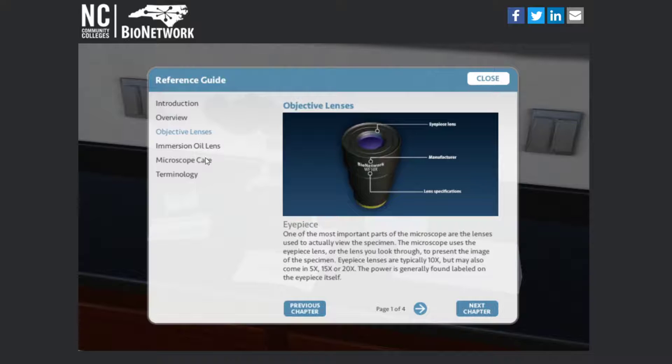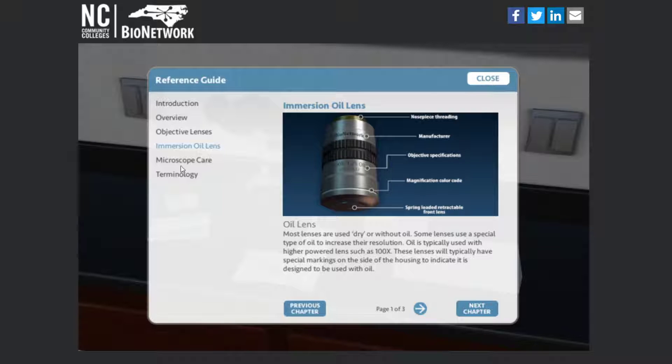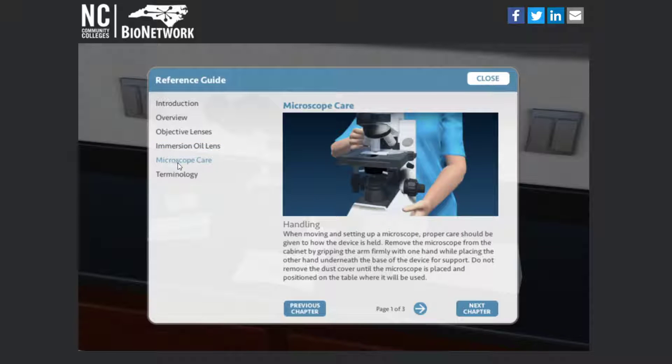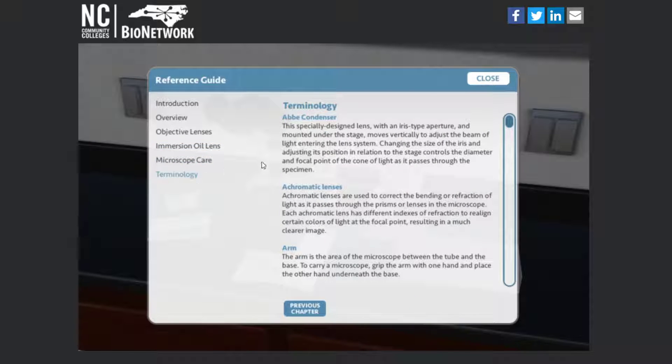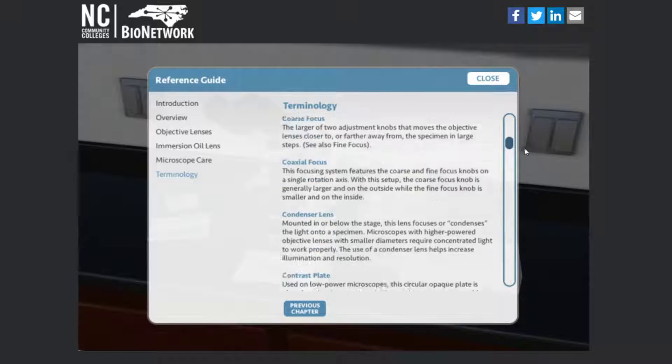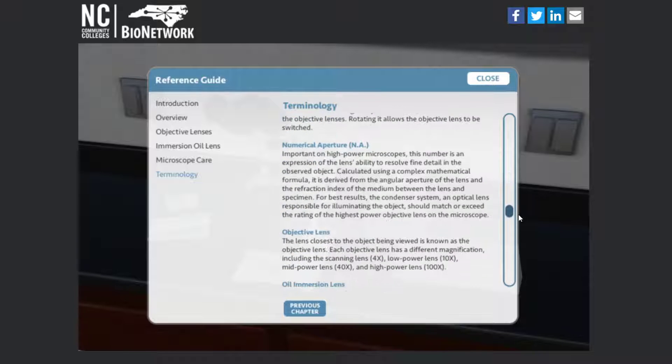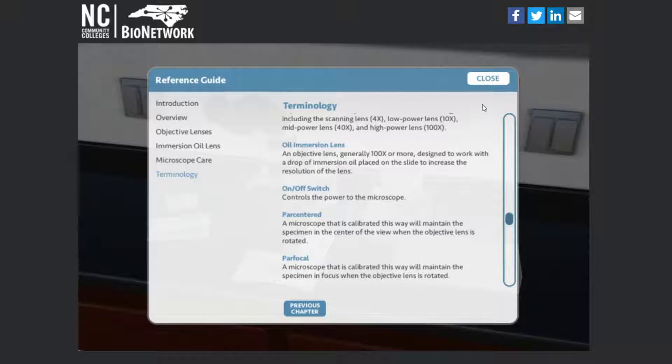Talks about objective lenses. They even got an oil lens option, tells you how to use that. Explains how to care for the microscope and then you can take a look at the terminology. They get really in detail here, more than I'm gonna ask you to know in middle school.